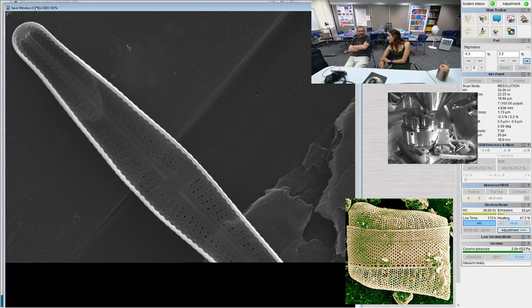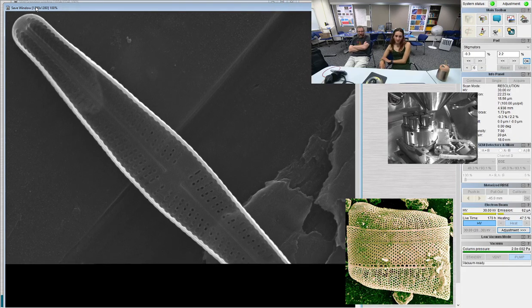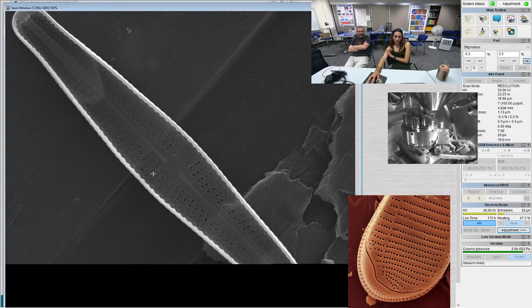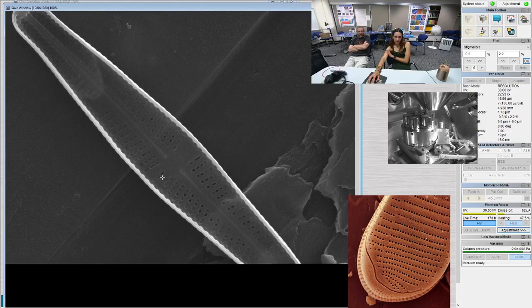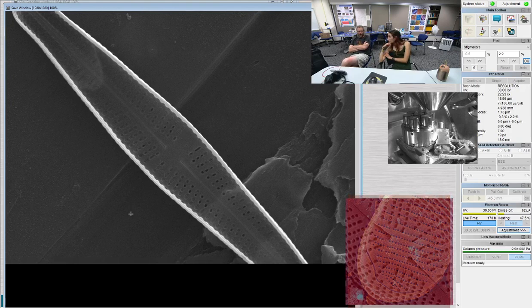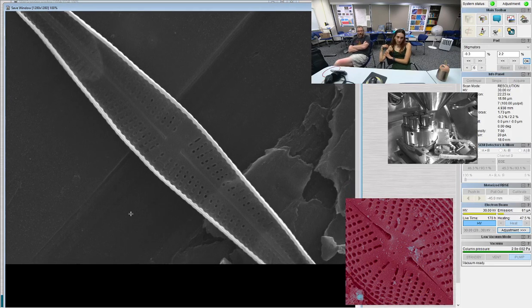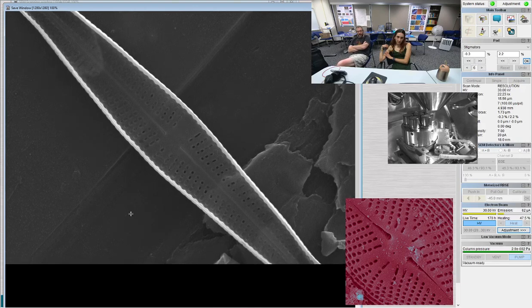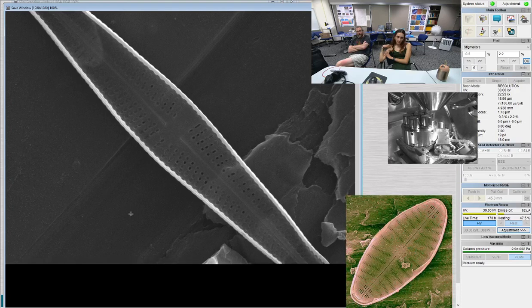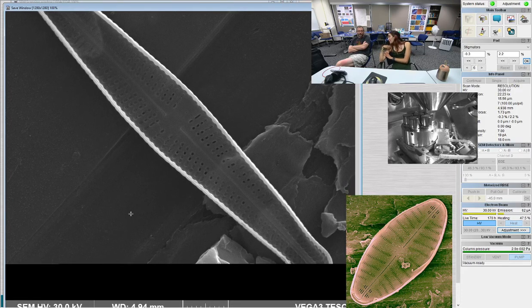Not sure about this genus for this one. It's like Achnanthidium. I hadn't noticed this difference. Here it's like Achnanthidium, except I don't think I've ever seen one with no raphe, and then I really don't know what it is if it's not that. Then it's a mystery. Then it really goes into the mystery pile. We should name it Mystery Achnanthidium?